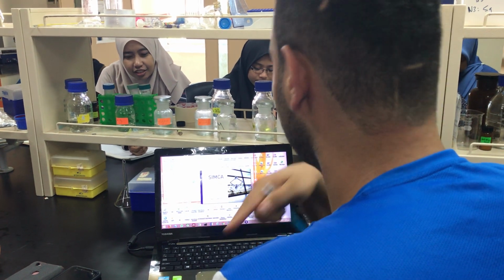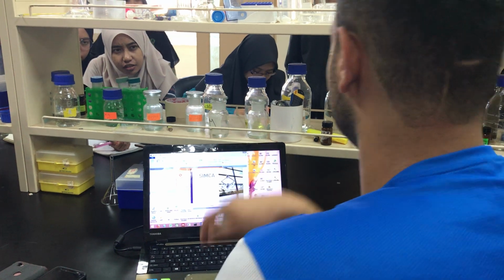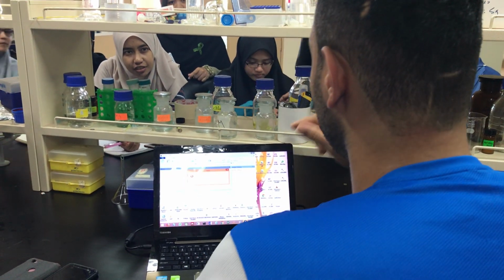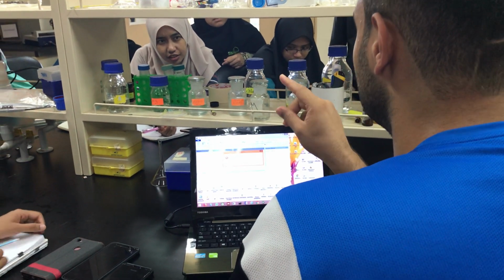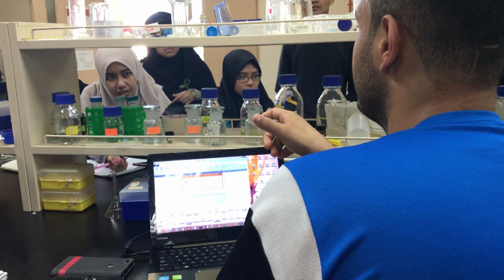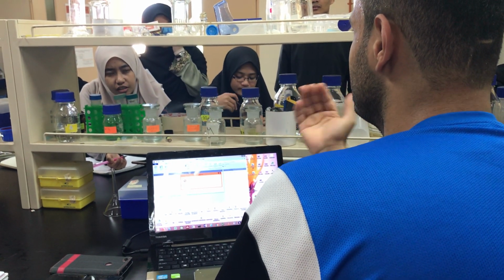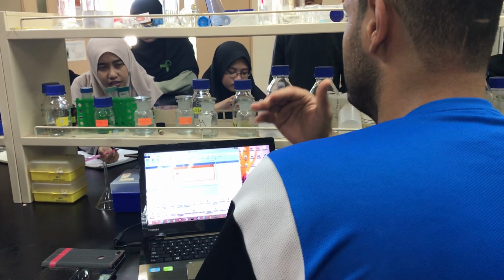I can force the software. I give it components, meaning the difference. I will show you here. When you run the software, first of all, if you ask the software to see the difference automatically, if there is a difference, it will appear as components. This shows how many differences there are, like 1, 2, 3 differences, 4 differences, 5 differences.